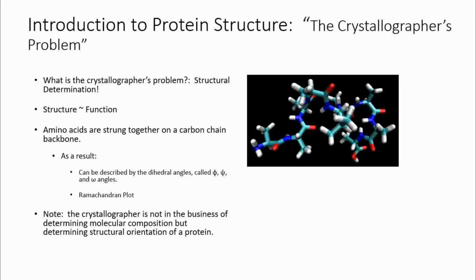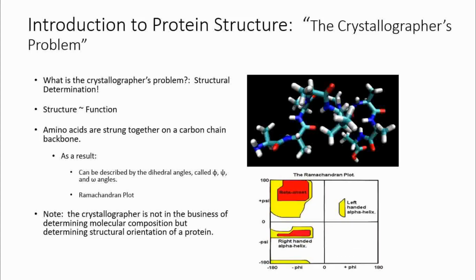Now, in a protein, as you can see here, there's one very complex one, and you will see a lot of foldings and a lot of angles, and these angles and protein foldings we need to understand to their basics. So we'll take a gradual step to understanding how this protein folding can be deciphered. But just to give a broad idea, when you use this crystallography technique, you use X-rays, and these X-rays are passed onto your protein of interest, and you get a Ramachandran plot. It is similar to this plot, and in this plot, as you can see, grossly the areas are divided. So you see a lot of segmented areas.